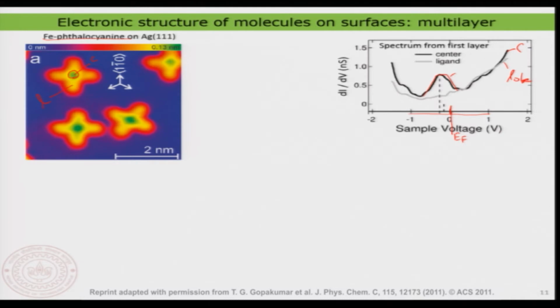What is so different for this molecule compared to the molecule that you just saw in the previous lecture? That is where the sodium chloride plays a role. When a molecule goes onto the surface, it is not necessarily just sticking on the surface; the molecule has a kind of chemical interaction with the surface. Particularly when you have metallic centers, that metal would interact with the surface metal and make a new bond between the molecule and the surface.